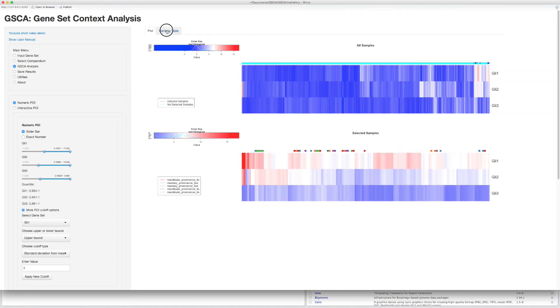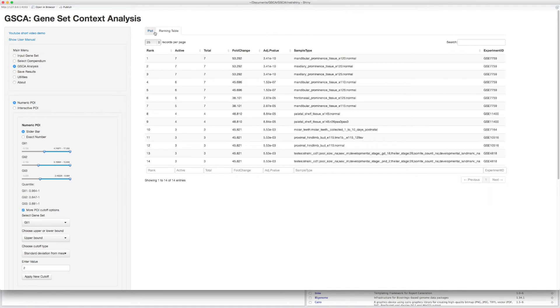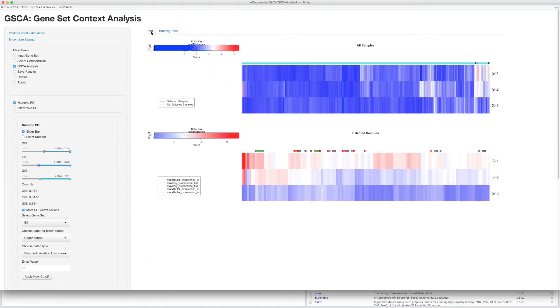Go to the ranking table to check the details. Now, to specify POI interactively, choose Interactive POI.